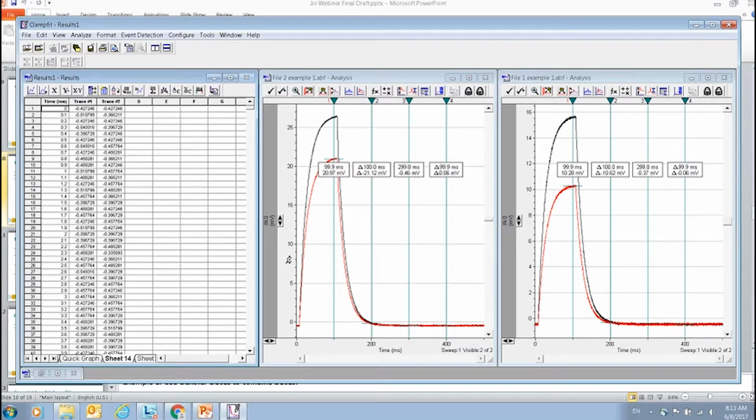now you can see the data points at each time point. I'm sampling at 10 kHz, so you can see that every 0.1 milliseconds there will be one data point. The time column is spaced every 0.1 milliseconds. For each data point, there are two corresponding y-axis numbers. That's your trace 1 and trace 2.